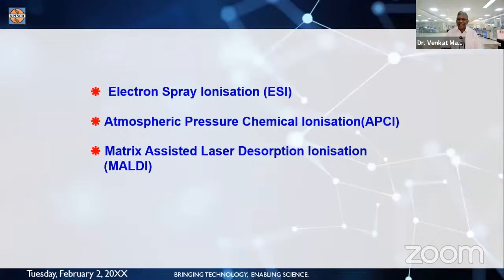You know, the beauty of liquid chromatography mass spectrometry is that the ionization and the interface are done simultaneously. The second most important thing is it's a mild ionization, soft ionization. Therefore, you are able to see your compound intact in most of the analysis. Sometimes you see it in the form of an adduct also, depending upon what kind of mobile phase you are using.